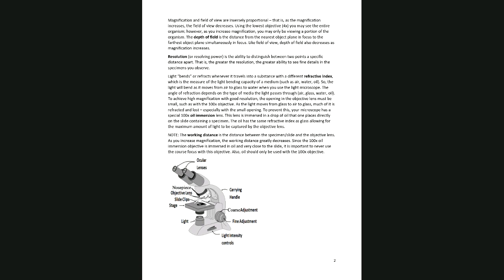So when do you open, when do you close the iris? Is it true you open it when you want less light and you close it when you want it to be brighter? The opposite. So close it to make it darker, open it to make it brighter. But when do you want to do that? Using what magnifications? No idea.